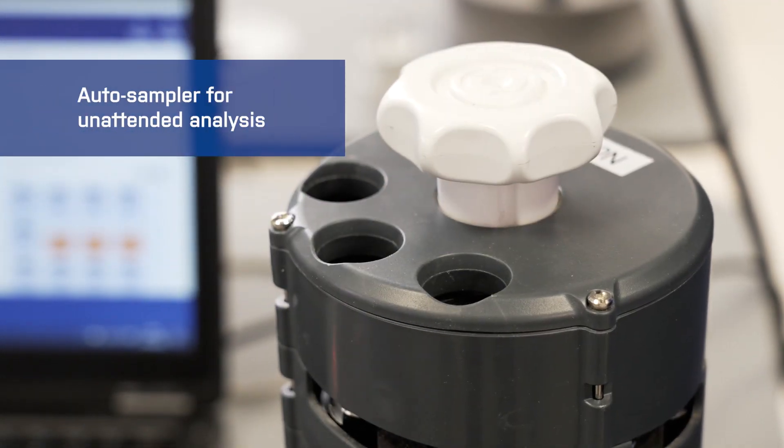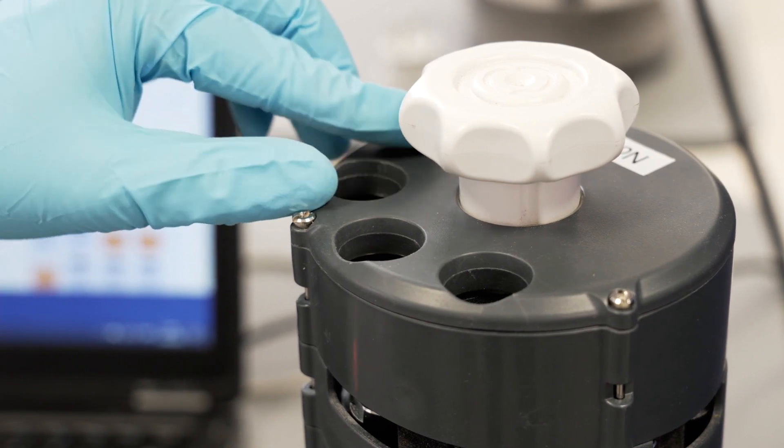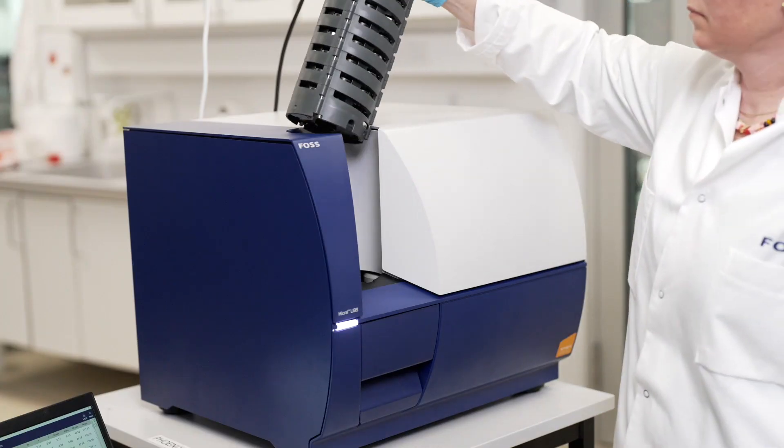60 pellets are placed in the auto sampler cassette and loaded into the Micral LIBS, which has a total running time of approximately 60 minutes.